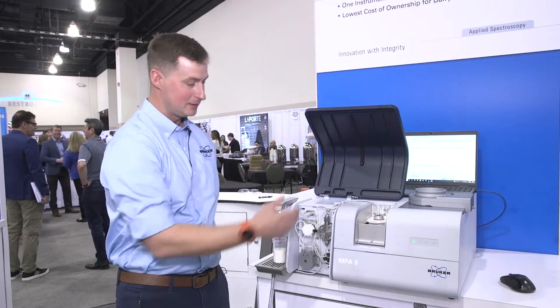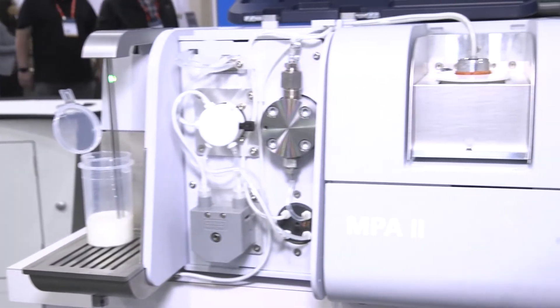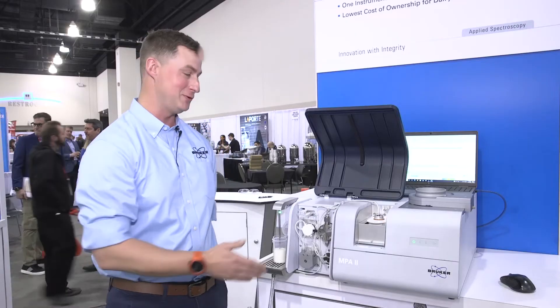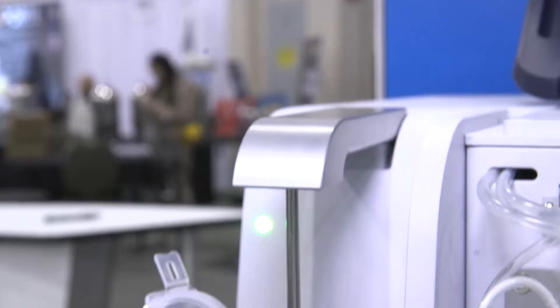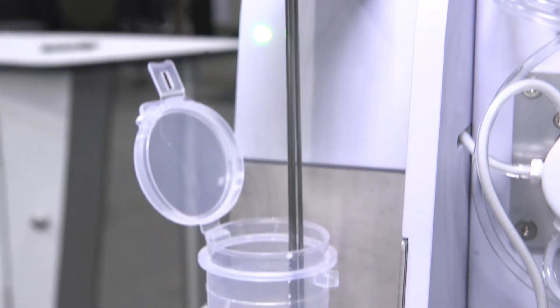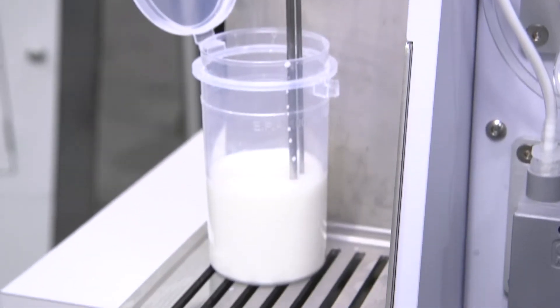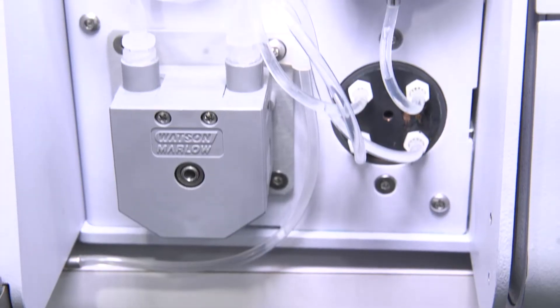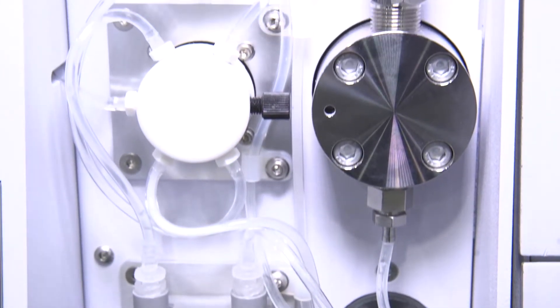If I open up the lid here, you can see that we've got a homogenizer pump and a peristaltic pump. What this allows us to do is reduce the use of the homogenizer pump and therefore reduce the cost of maintenance of the system. So we're only pumping raw milk through the homogenizer. All other liquid samples are run through the peristaltic pump.